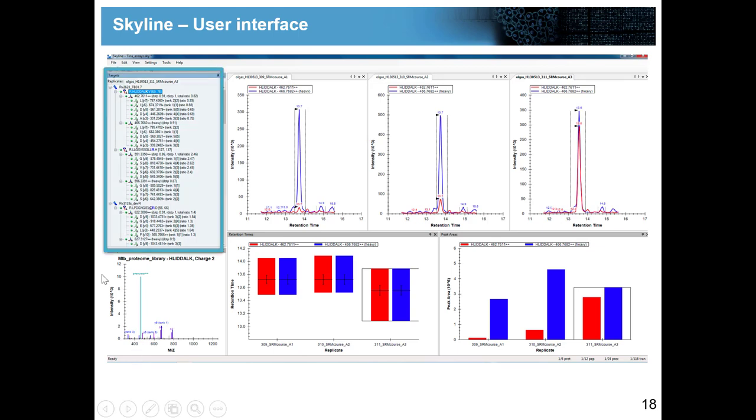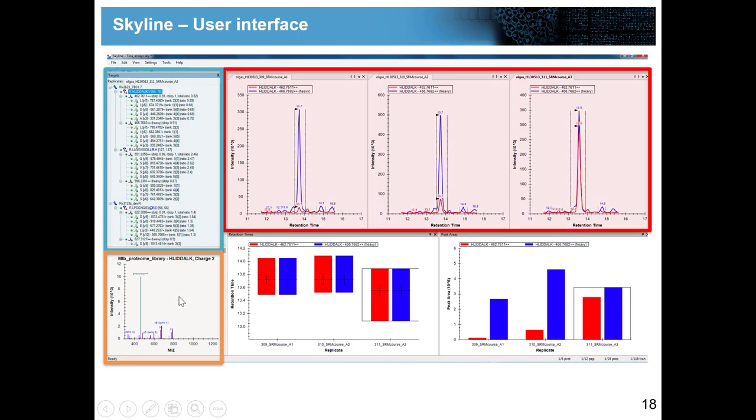In this window we have the library. I loaded a library into this document and that's where I see the library spectrum of the highlighted peptide. If I would highlight the next peptide I would see the new library spectrum for that peptide. This window, these three windows, are my raw data windows. Here I see the raw information, the extracted ion chromatograms for all those different targets.